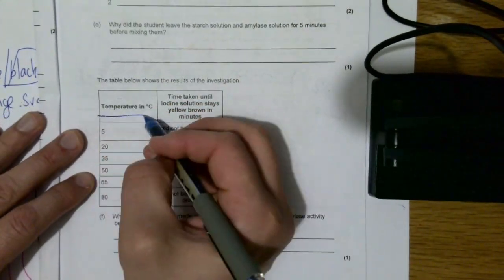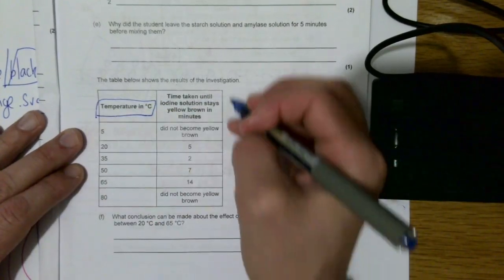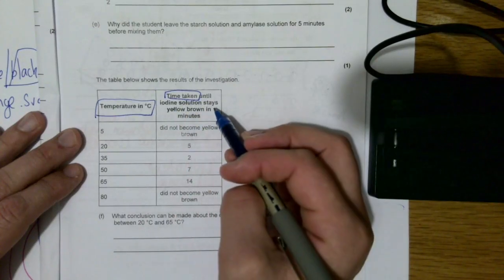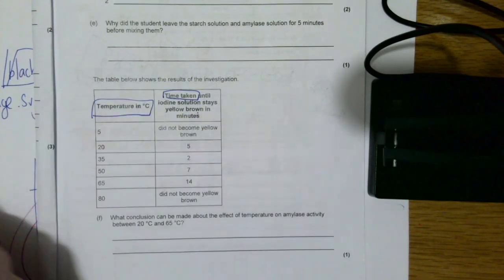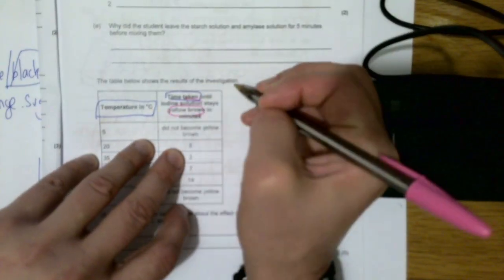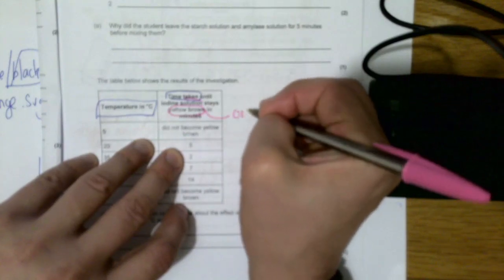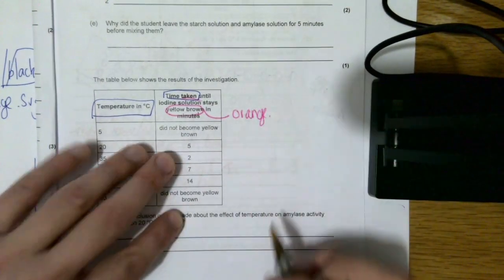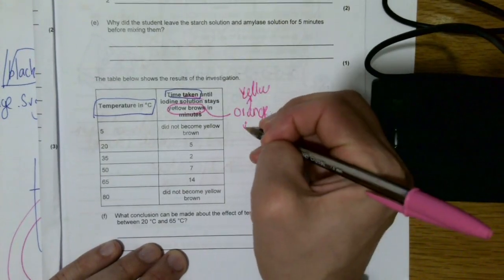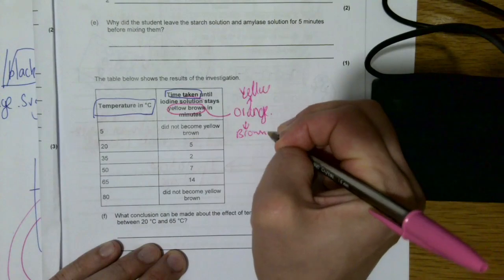This time they're changing temperature and they're measuring the time taken until the iodine solution stays yellow-brown. So that there is our first obstacle, yellow-brown, because we know iodine is orange, but it could be yellowish or it could be brownish. And obviously it's all subjective.